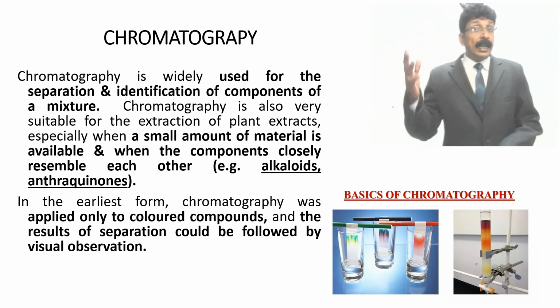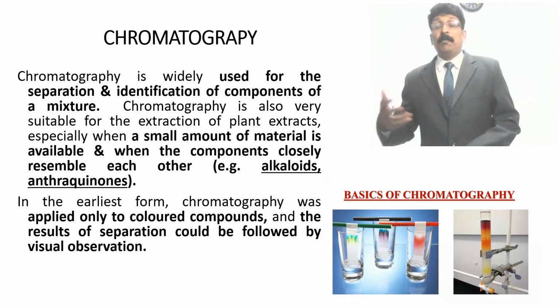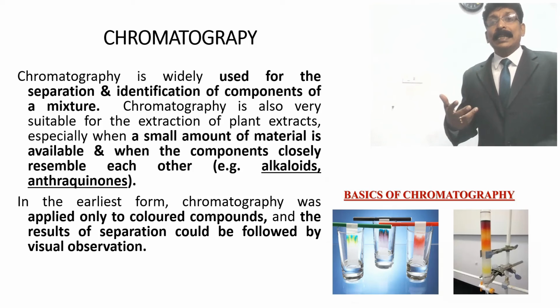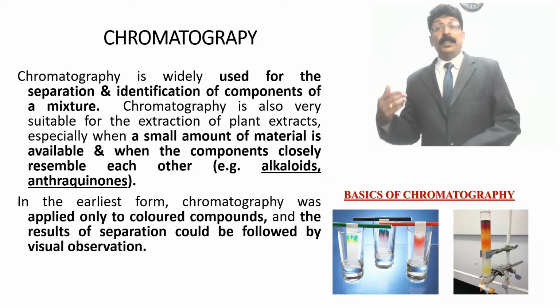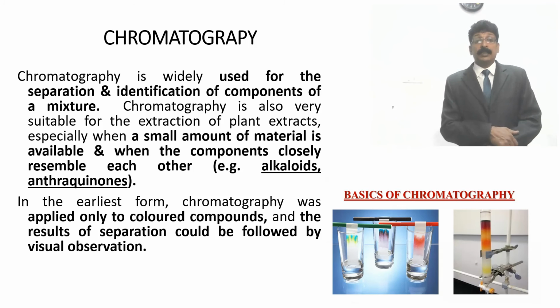And then the development of chromatographic techniques made it possible to detect even colorless compounds by means of detecting liquids and using various techniques. Instrument analysis can also be done, using UV spectroscopy and fluorimetry, for compounds that react with light radiations. So that's what colorless compounds are.